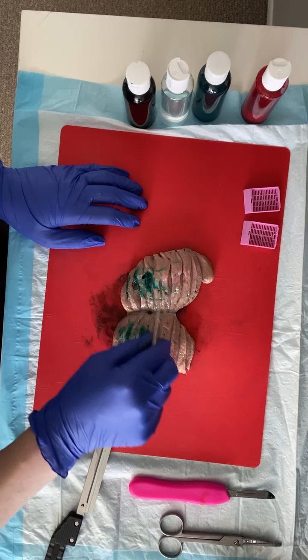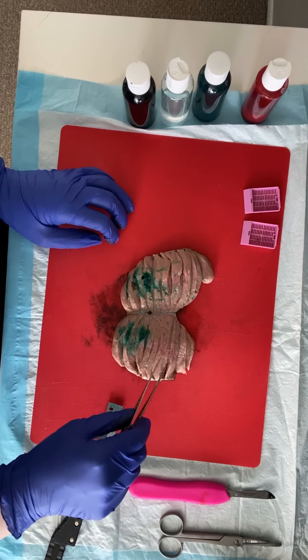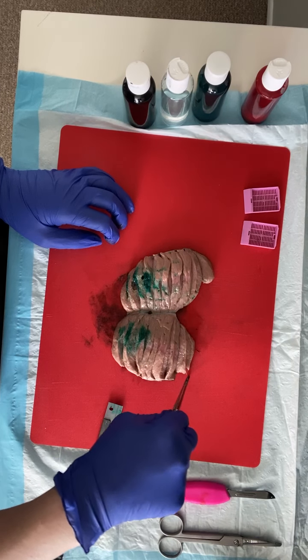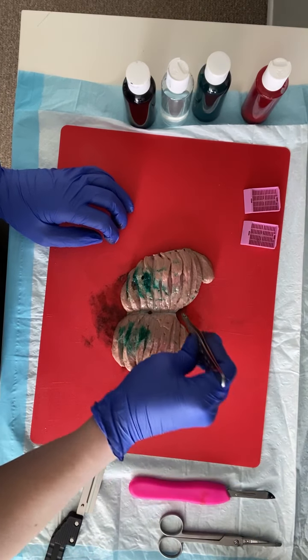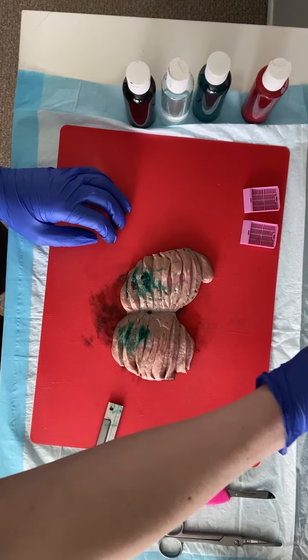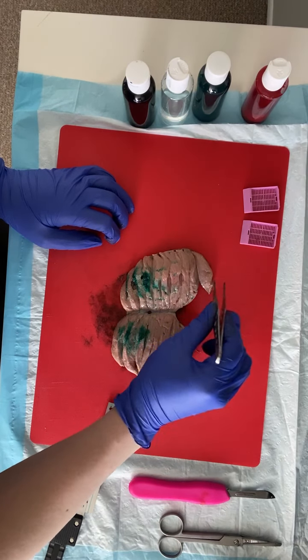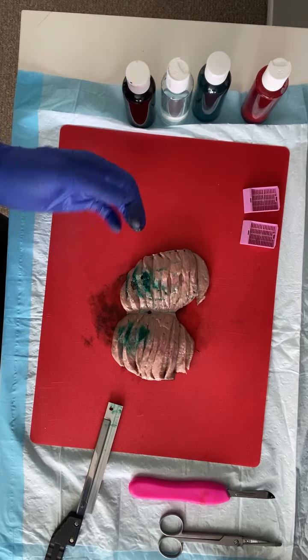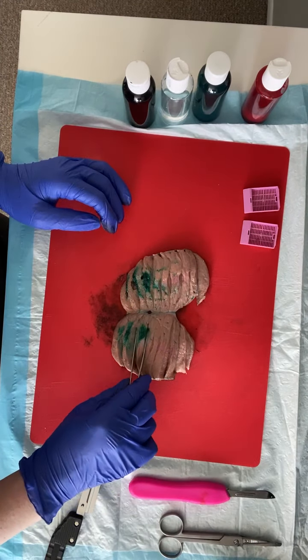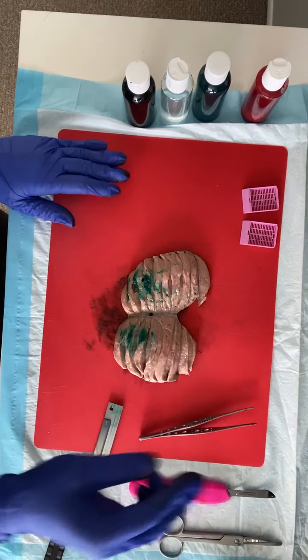Sample extensively all the areas that look different and show all important relationships. We're also going to sample uninvolved normal testicular parenchyma and uninvolved epididymis. For our spermatic cord, we'll submit the peritesticular spermatic cord, the mid-spermatic cord, and a shave of our spermatic cord margin. Testicular grossing is pretty straightforward — not too dissimilar from the kidney. If you have any questions, just send us an email.